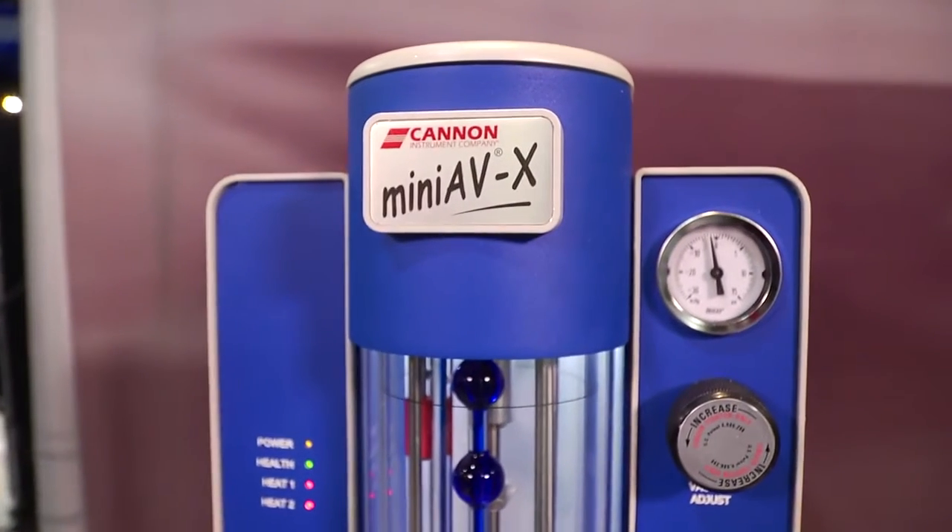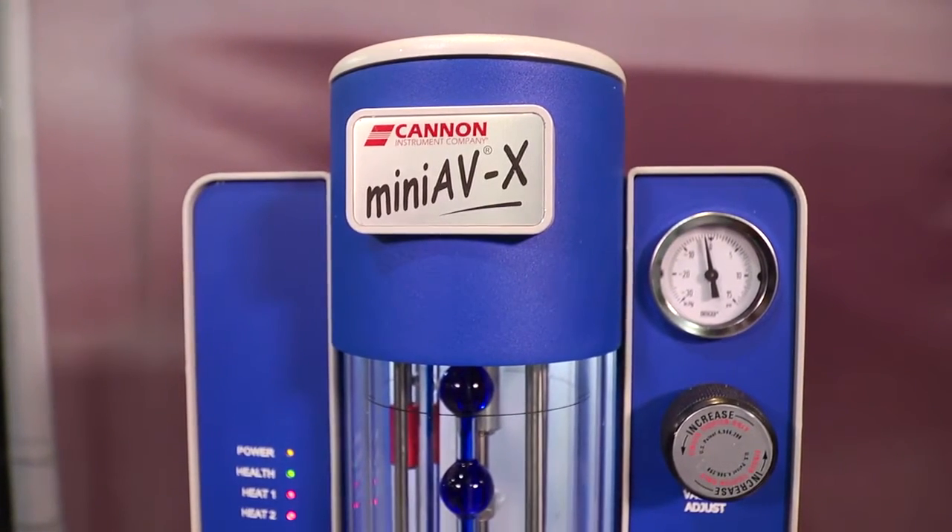Hi, my name is Pat Magai, president of Canon Instrument Company, and today I'd like to talk a little bit about our Mini AVX automated viscometer, which was brought out in 2008 as a mid-market solution to bridge the gap between manual kinematic viscosity measurement and the fully automated viscosity measurement that we've been on the market with since 1972.